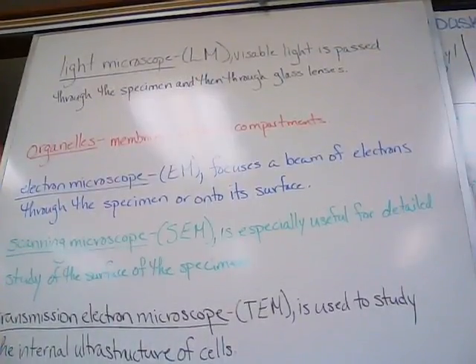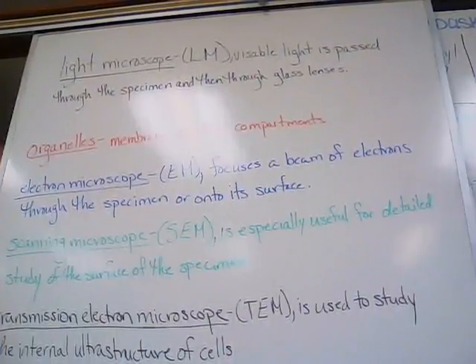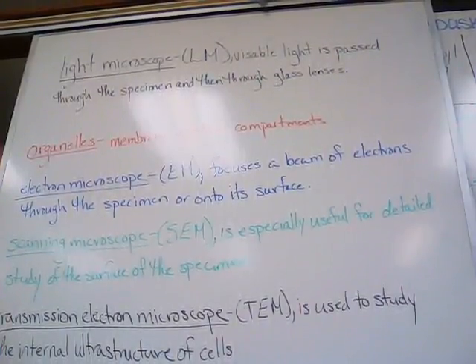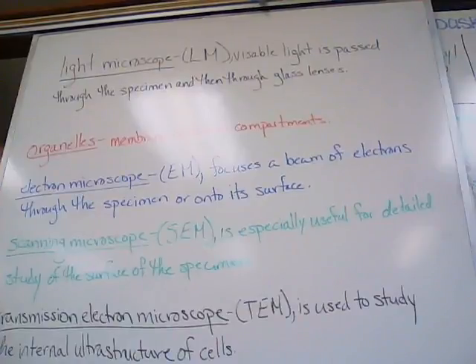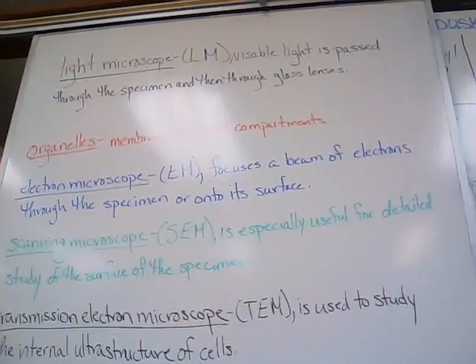The most powerful machines, called ultracentrifuges, spin up to 130,000 revolutions per minute and apply forces on particles of more than 1 million times the force of gravity. Cell fractionation enables researchers to prepare specific cell components in bulk and identify their functions, a task that would be far more difficult with intact cells.